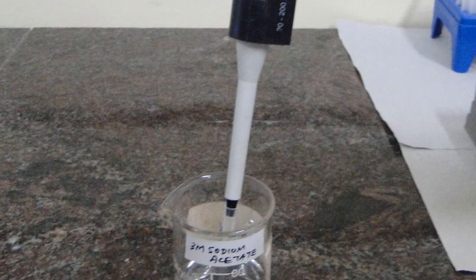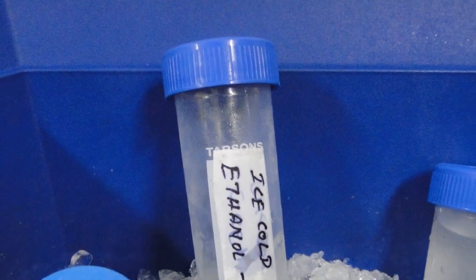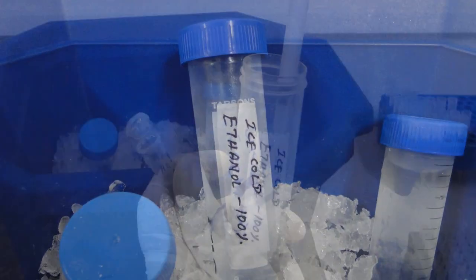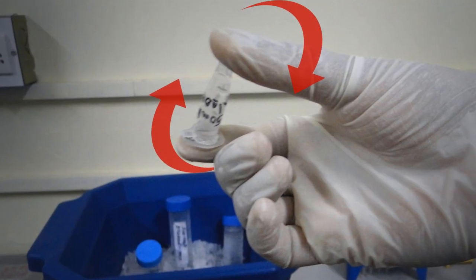Add 3 molar 100 microliters of sodium acetate to the vial. To the same vial, add 100 microliters of ice-cold 100% ethanol kept in an icebox. Mix it by inverting the vial slowly.